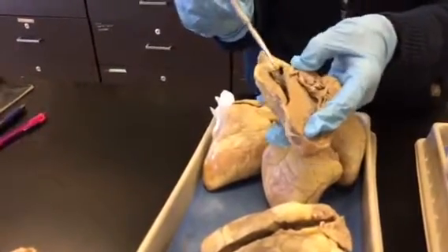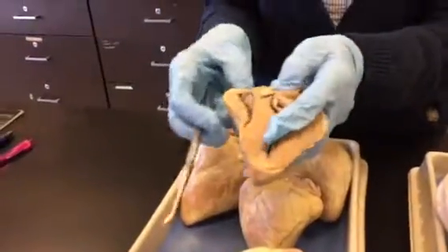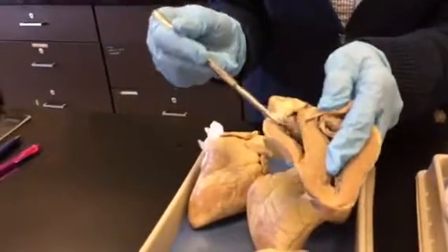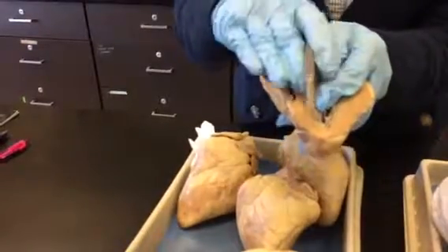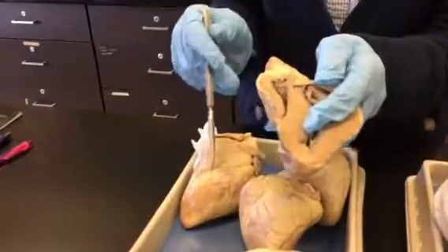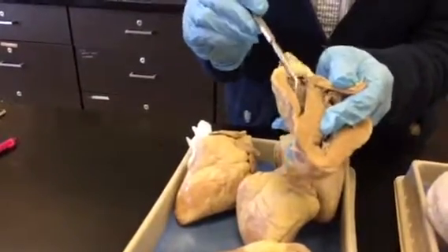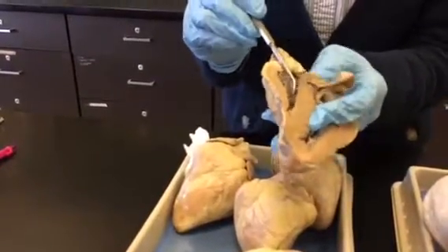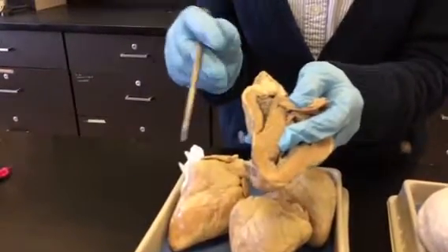To get from the atrium to the ventricle, blood has to go through this valve right here. These are the cusps — these little flaps of tissue. This is a three-part valve, so here's two of the cusps and the third one would be on the other half of the heart. You see all these little strings here? These are the chordae tendinae — the heart strings. Those anchor those flaps to the ventricle wall.